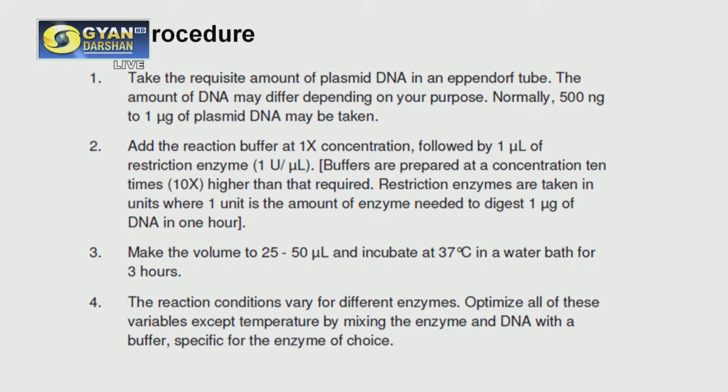You need a restriction enzyme buffer, because any enzymatic reaction will need a buffer. You need the enzyme itself. You need water, and of course you need the DNA, that is the plasmid DNA or the insert DNA, whatever be the case.